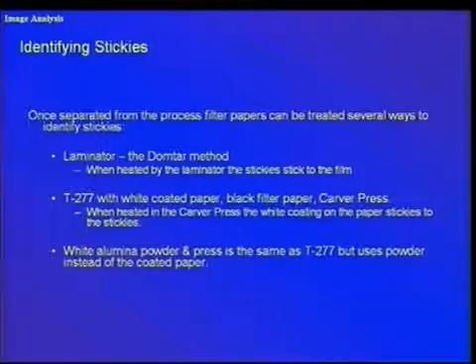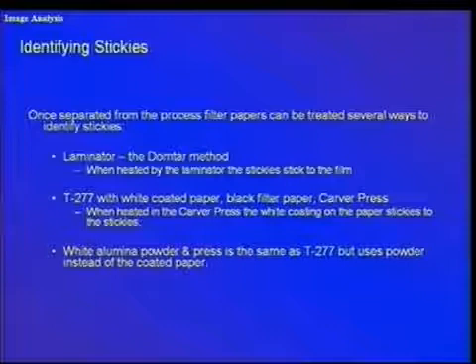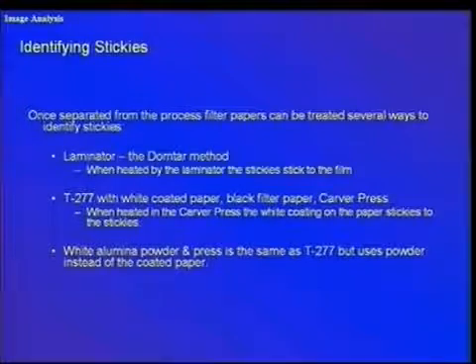One of them is a laminator technique, in which the filter paper is processed through an ordinary office laminator with Mylar films, and the stickies will stick to the film preferentially, and the rest of the material is separated. In the image analysis system, we simply count the stickies that stuck to the film.